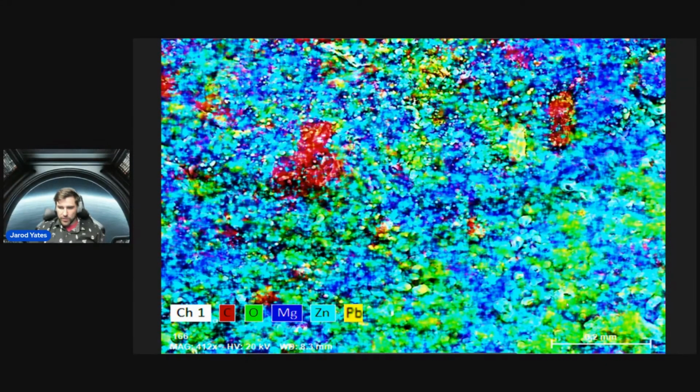And wherever that happened, we also happen to have oxidation, right? So it seems to me, gonna throw out a hypothesis here, that because some of these are ruptured and not all of them are ruptured, something happened to cause just some of them to rupture, right? So it might be, once again, hypothesis, that they're acting kind of like capacitors, right? And they're getting overcharged. And for the ones that get overcharged, they rupture.